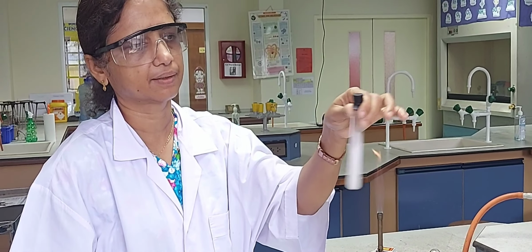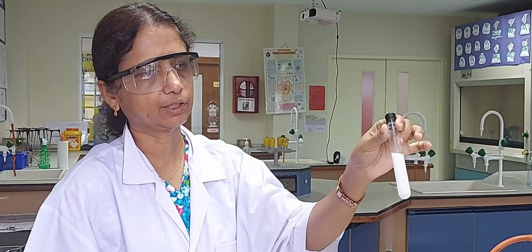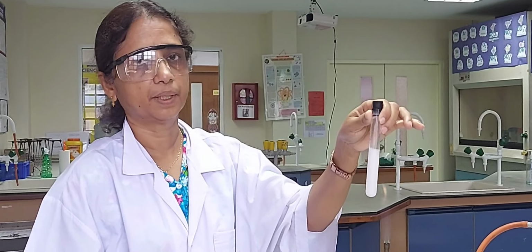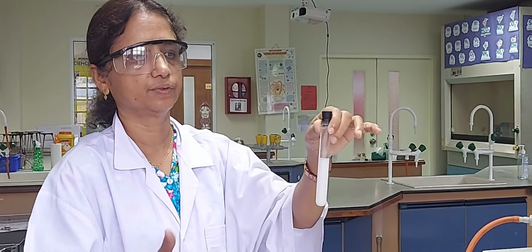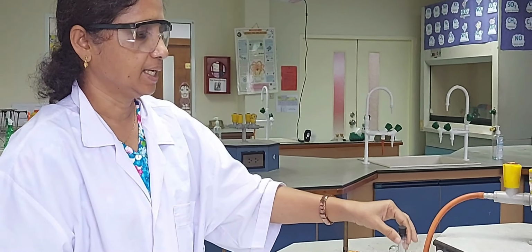Maybe it will be a little cloudy, but since calcium hydroxide is not completely soluble in water, the insoluble part of the calcium hydroxide will settle down, and the calcium hydroxide which dissolved in water will form the upper layer. So I leave it to come back to it later.